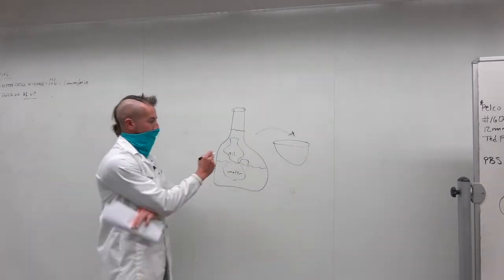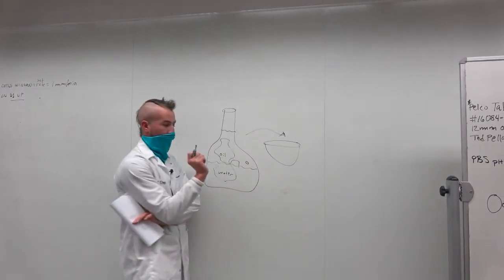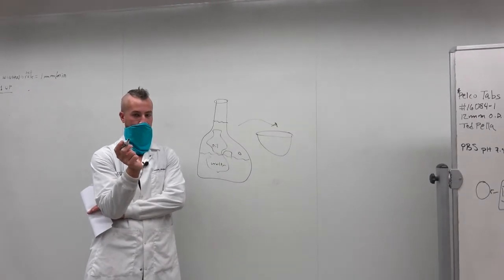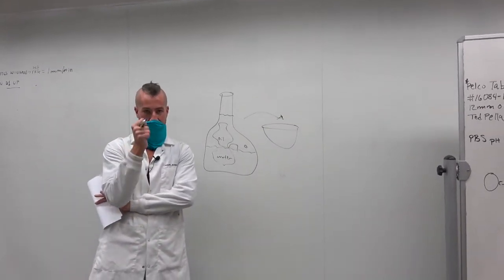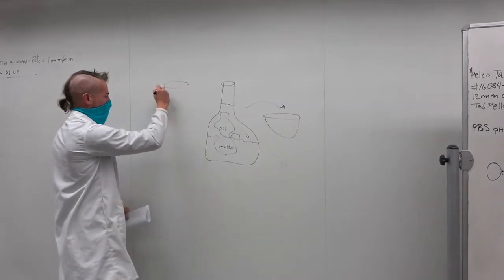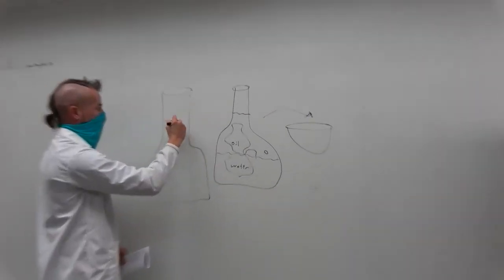We're going to make these emulsions so small that they become colloidally stable. If we're just putting the energy from shaking with your hand, you're going to have your oil and vinegar, right?